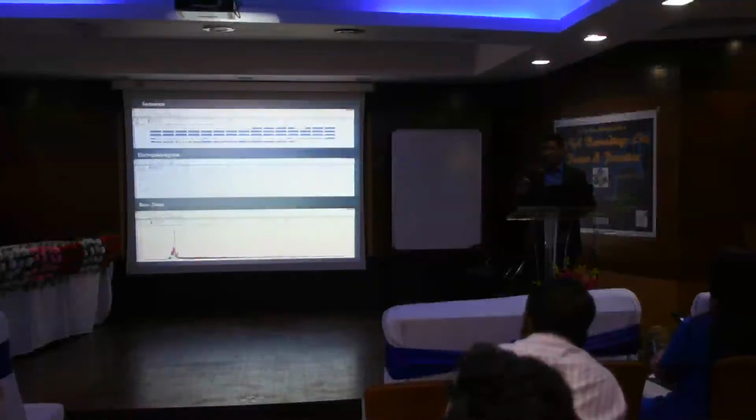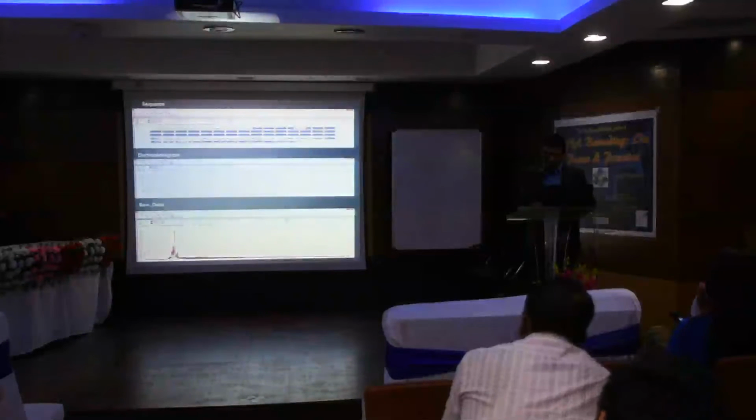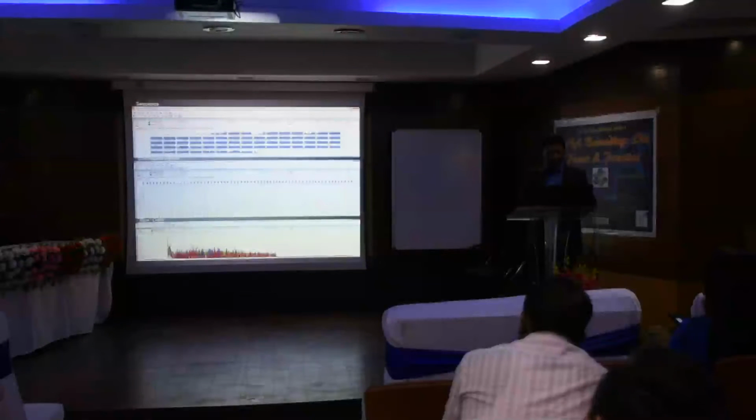No, you haven't done anything. You don't know anything about this, and you wasted the whole money. So this happens. And this is like a salt concentration I am telling you. If you are having such a type of sequence, then feel good. You are a good biotechnologist. You did a wonderful job. Although it is not fully wonderful, but it is wonderful.